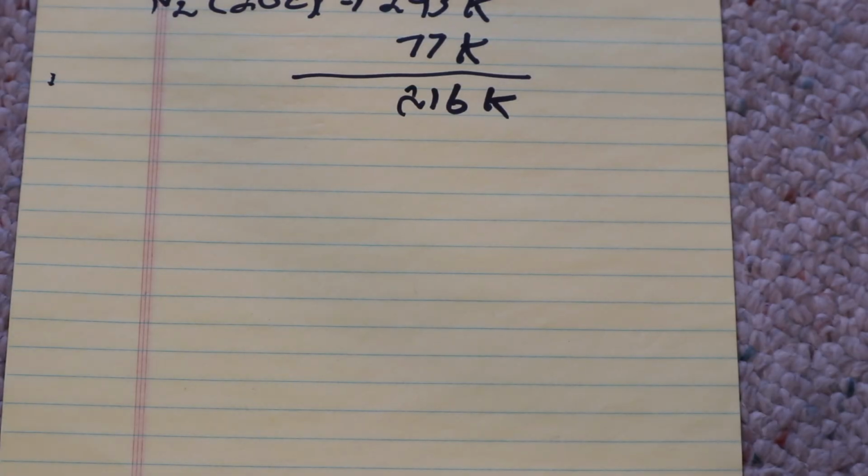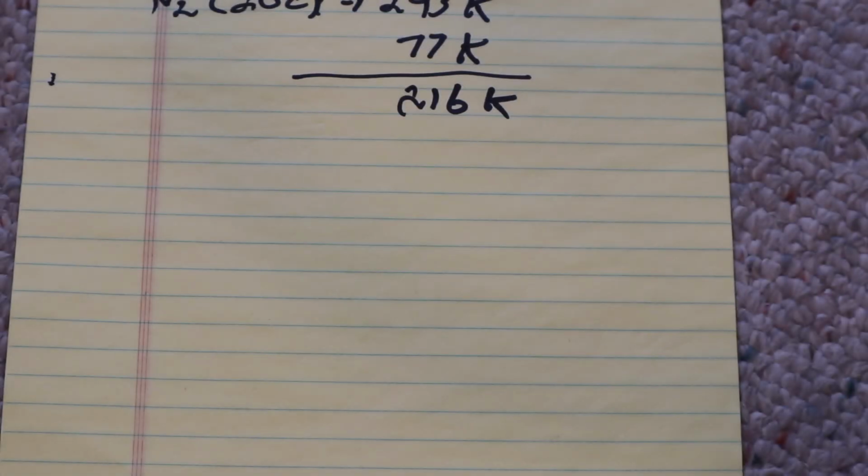So I have a Rycor K535 cryocooler. The heat lift of the cryocooler at 65 Kelvin with an ambient temperature for the heat rejection close to 0 centigrade is somewhere around 7 watts.